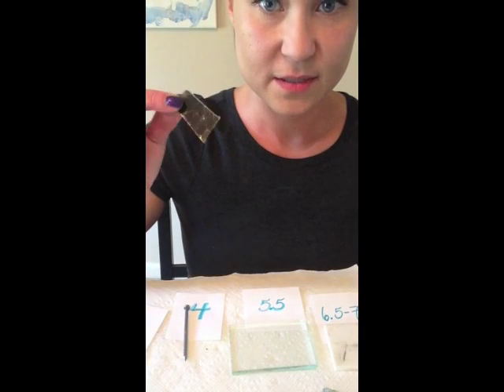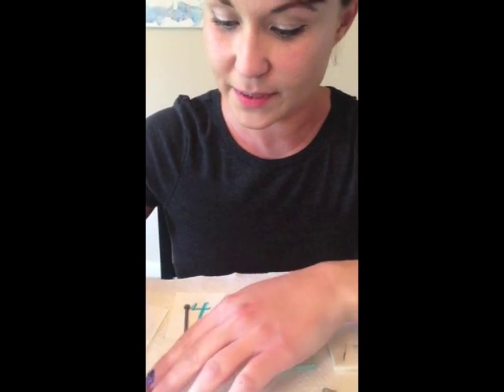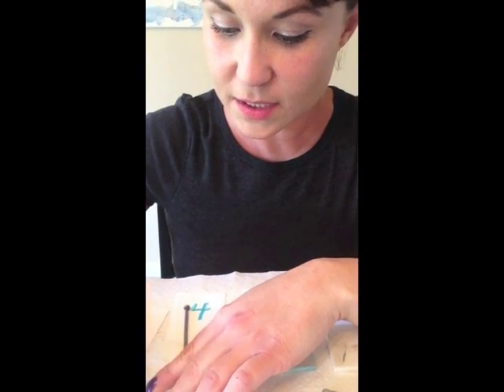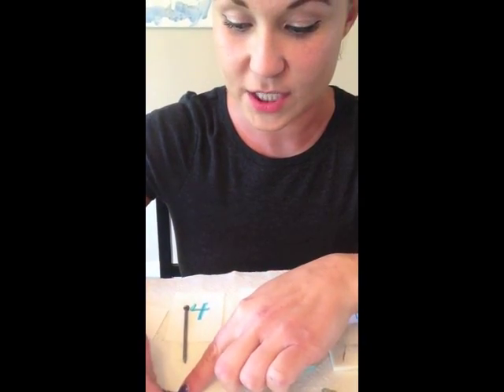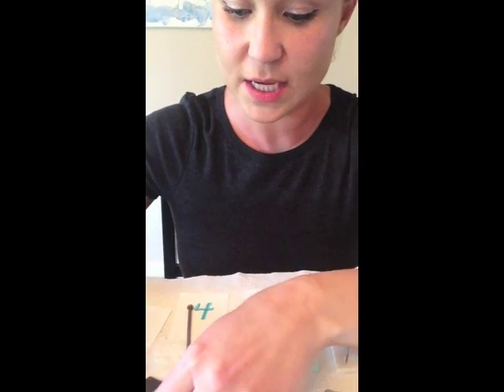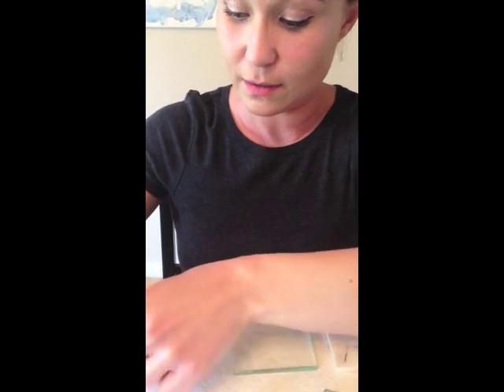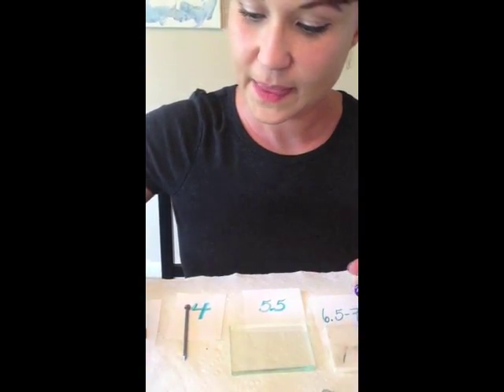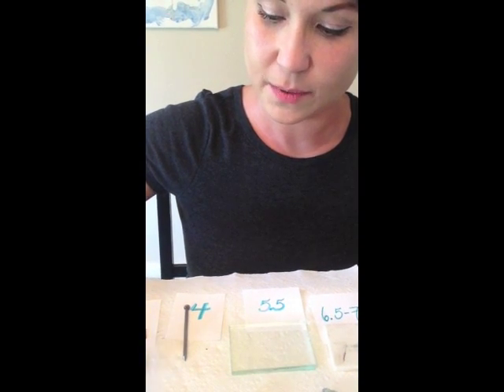Next up, we have this, which you're going to probably be seeing a lot of. Step one — see what it does. It does not scratch the penny. Let's see if the penny will scratch it — and yes, that definitely made a scratch. So we can stop right there and put that one at a little bit less than a three.